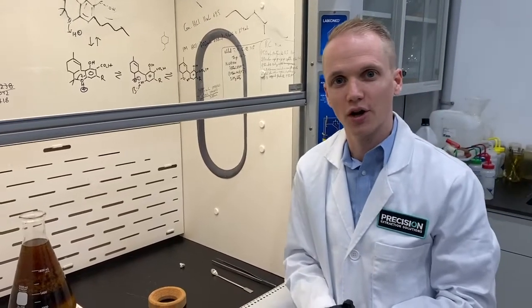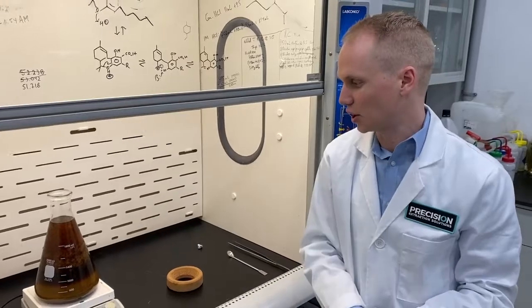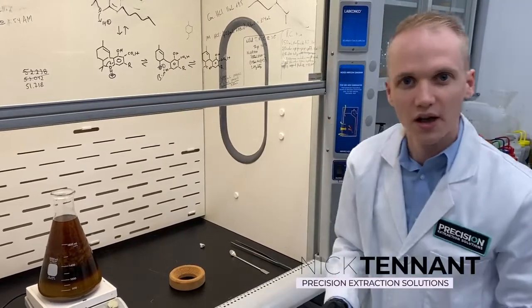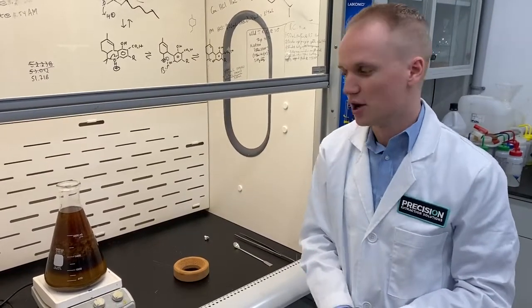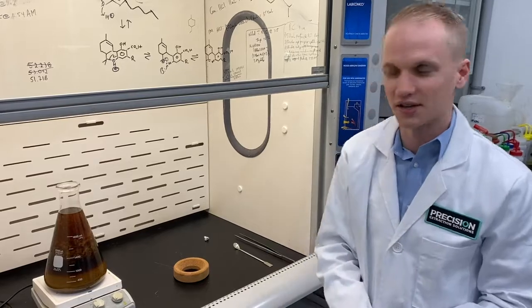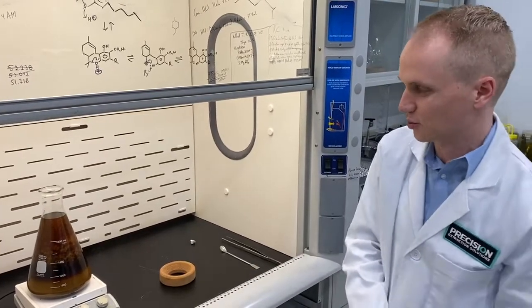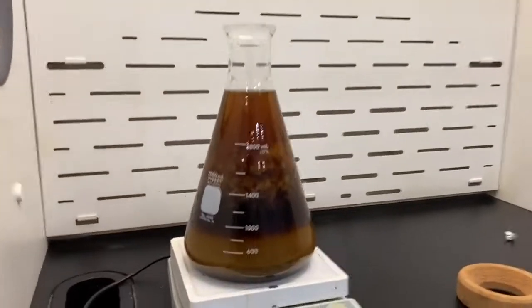So if you're using a room temperature process like this, you can generally speed up what took normally with ethanol, say 24 hours, or at the lowest, say four to six hours. This just took four to six minutes to do. So a massive efficiency increase, and we're very proud of the process that we've helped to perfect in the lab here. We hope you enjoyed it today. Thank you.